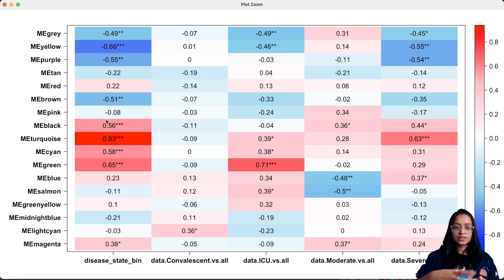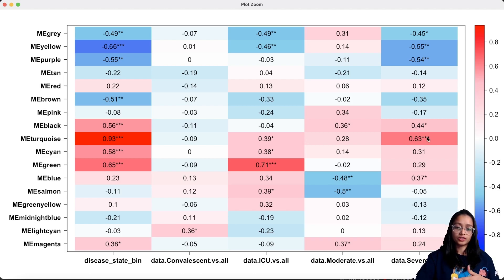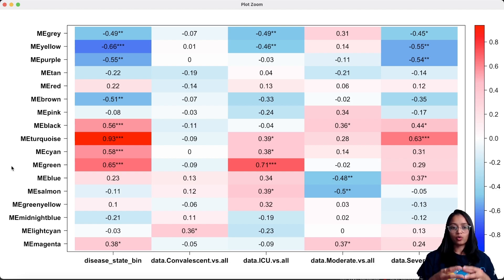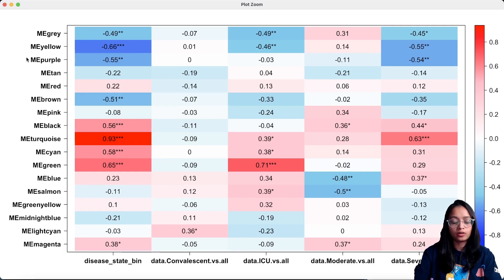We can also identify modules significantly associated with other traits. Module turquoise, for example, seems to have high significance and is significantly associated with severity of the disease. The genes belonging to these modules can be extracted and further investigated to study the underlying mechanisms and pathways contributing to disease severity. Here, I'm more focused on the significance of the association than the correlation value itself — I'll explain that in detail shortly. Now, let us go back and identify what genes are part of module turquoise.